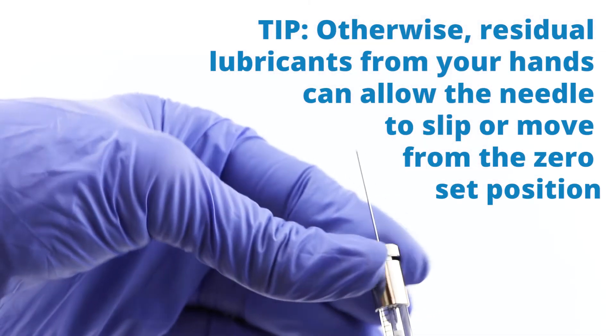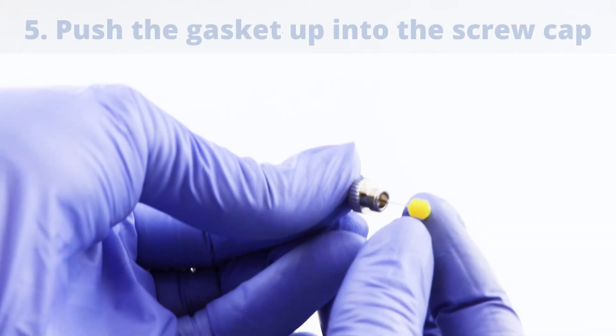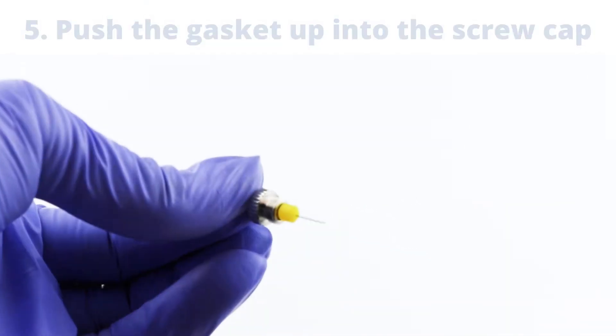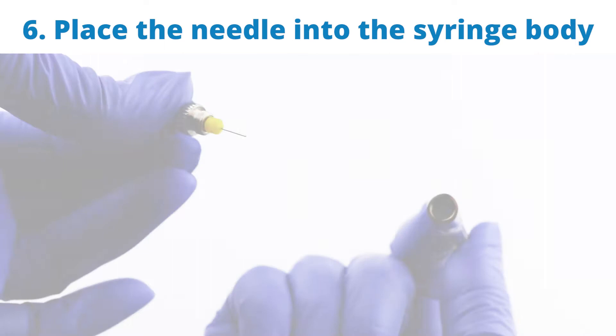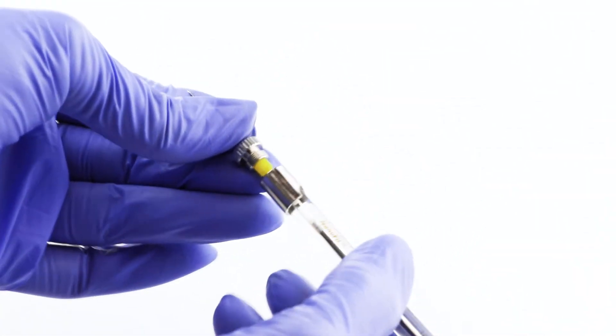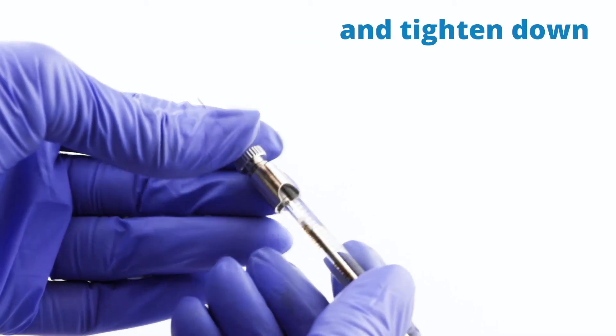If that has oils on it, the needle will slip and move away from the zero set position. Push the gasket up into the screw cap, then place the needle into the syringe body and align it to the zero mark. Then tighten it down.